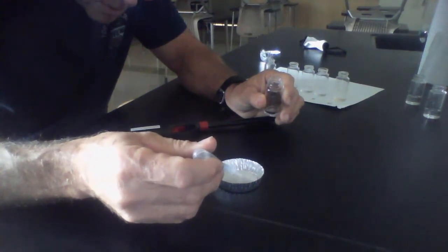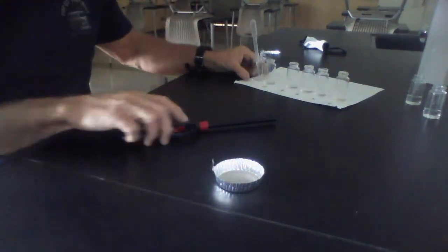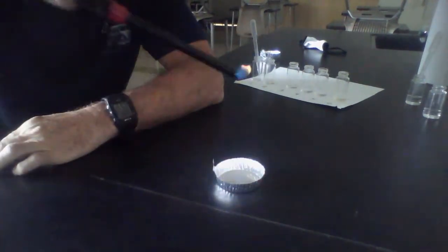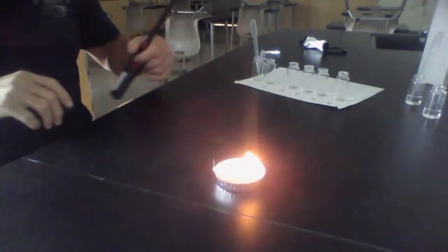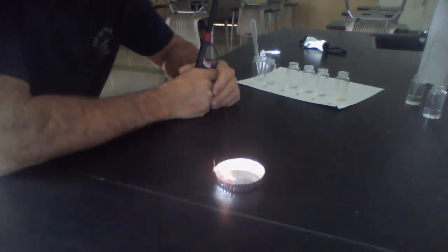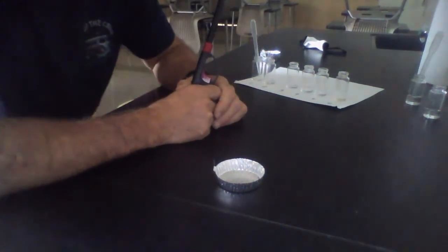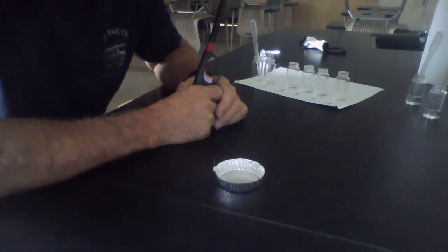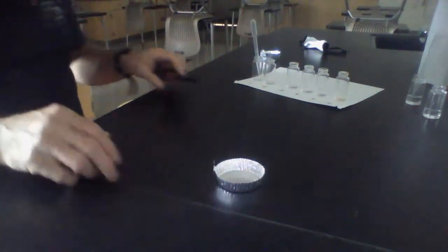1, 2, 3, 4, and 5. 3, 2, 1, ignite. Did it go? Nope. That was a little hard to light. Wow. And done. It seemed to burn a little thickly, I think. It reminded me of one of those where it kind of went to the edge. It didn't bounce around as much, and maybe the timing is helpful.